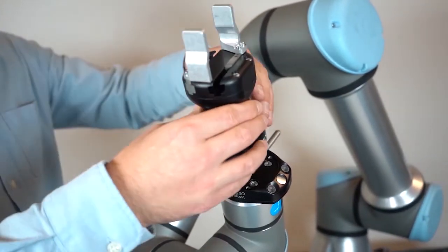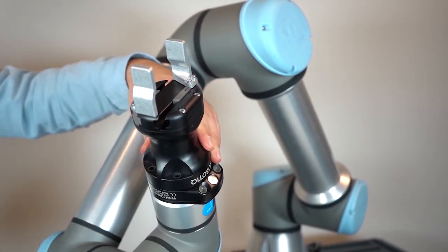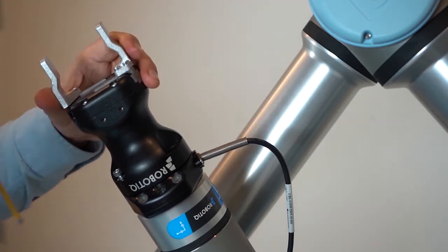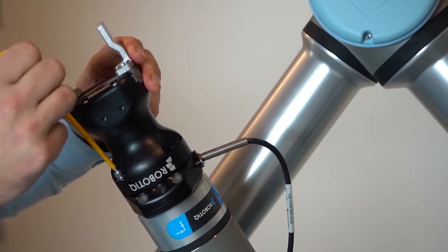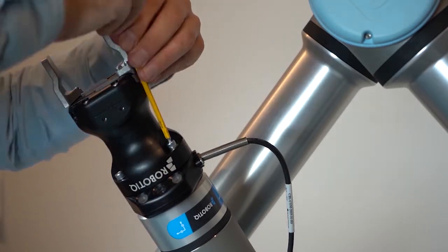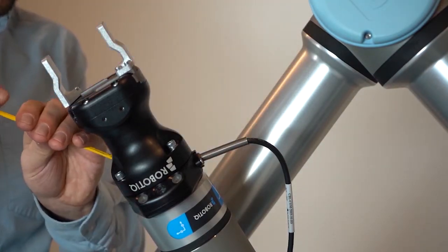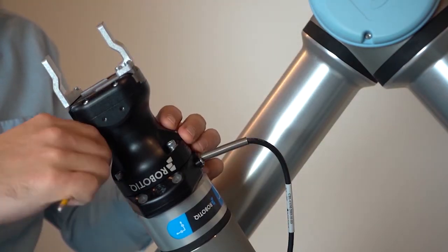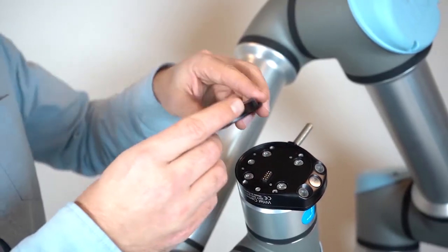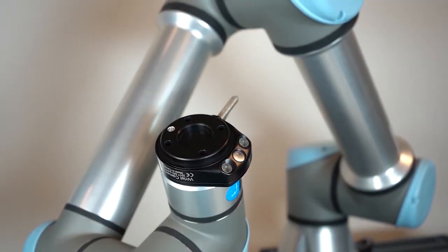The first option to add an end effector to the assembly is to mount a robotic gripper using M5 screws, which are made available with a camera plus gripper combo kit or with a basic gripper unit. The second option consists in fastening the provided adapter plate, which emulates the Universal Robots wrist, in order to add other end effectors to the assembly.